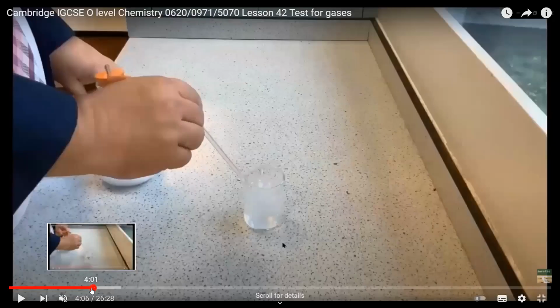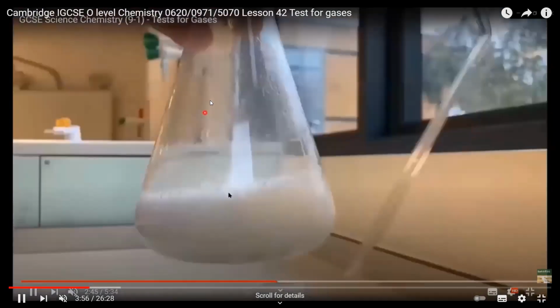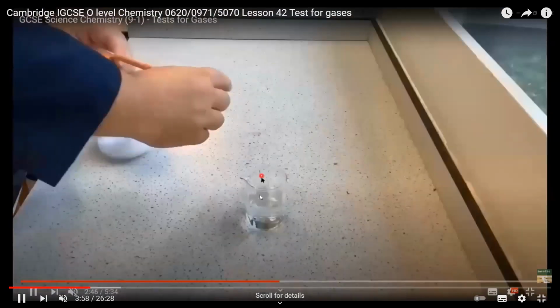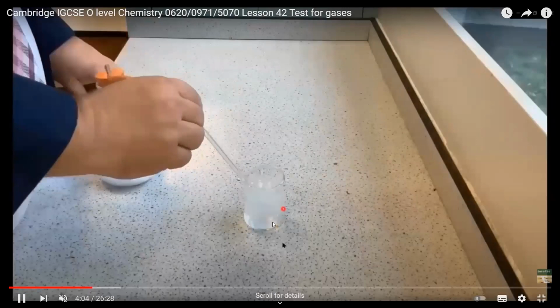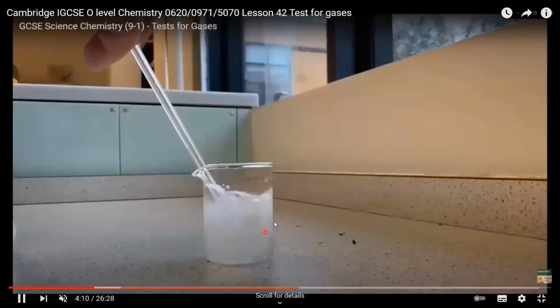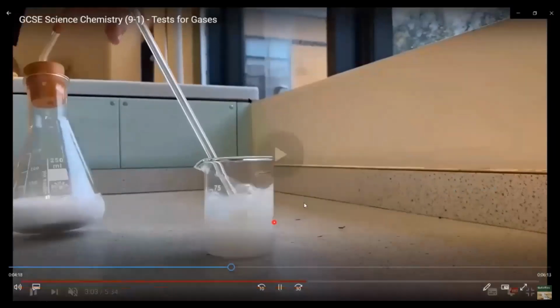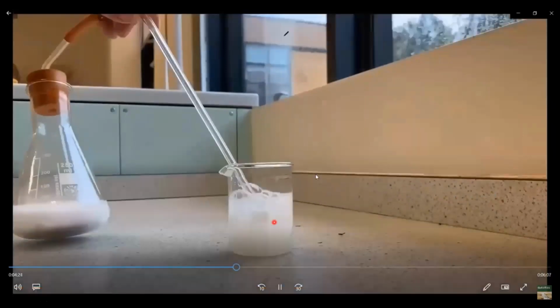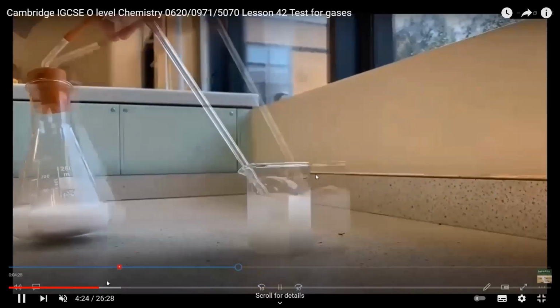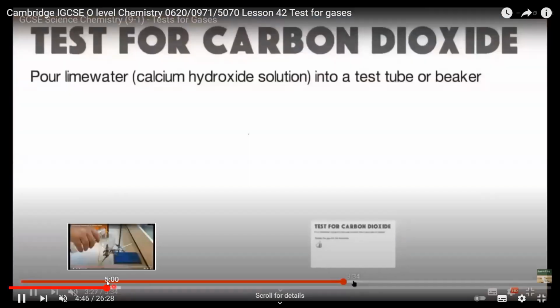If you want to test carbon dioxide, first carbon dioxide gas is produced, and this gas is passed through lime water. This is lime water. Originally the lime water is crystal clear, but when we bubble the carbon dioxide, the lime water will turn milky. If the lime water turned milky or chalky, it means the gas given off is carbon dioxide.